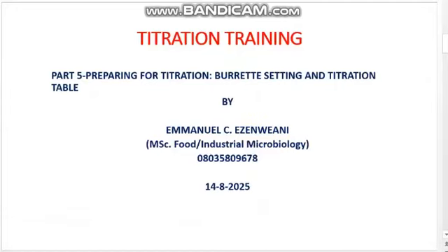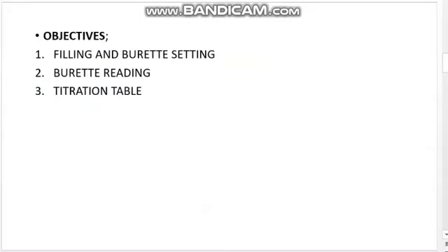You are welcome to part 5 of this titration training, which is focused on preparing for titration. Our objectives are burette setting and filling, burette reading, and the titration table.